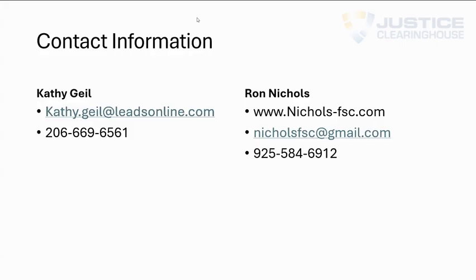Great. Well, let's dive right into the questions there. The first one goes to Kristen. Kristen wanted to know, do you know of anyone who's used VCM and testified in court about it? Not currently myself, no, I have not. I do know that many laboratories are gearing up. The one laboratory that may have is the Houston Forensic Science Center, because I do know that they've been running VCM for quite a while.